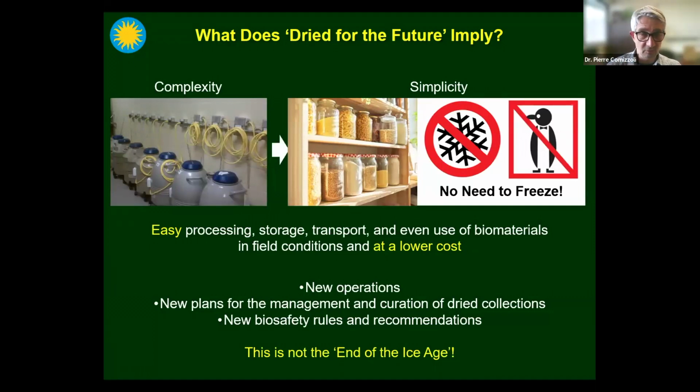However, what you also have to keep in mind is that if we switch, at some point, part of our storage of biomaterials to dried collections at ambient temperature, it's going to require new operations. We're going to have to make new plans for the management and curation of the dried collections, and importantly enough, there will be new biosafety rules and recommendations, because those samples are going to be so easy to store and so easy to transport that we're going to have to be extremely careful to make sure that they are safely stored also.